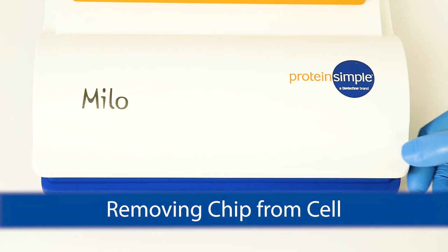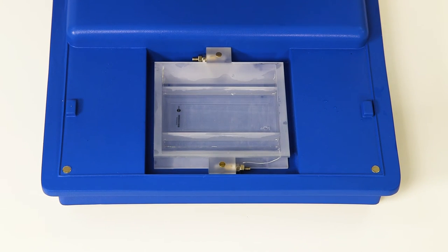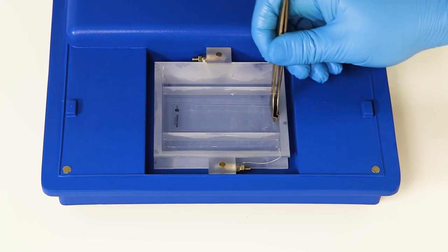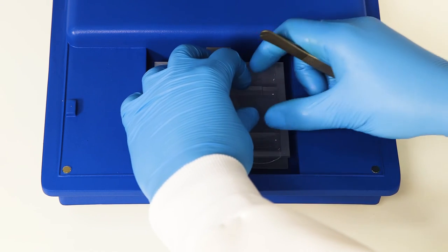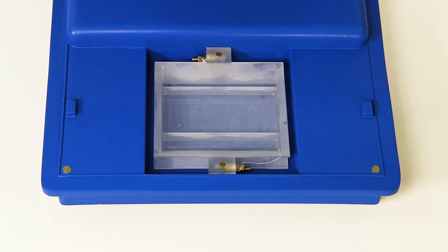To remove the SC-West chip from the electrophoresis cell, carefully wedge the tweezers provided with the instrument in between the edge of the chip and the edge of the chip reservoir, being careful not to damage the gel surface. Avoid touching the gel with your gloves.